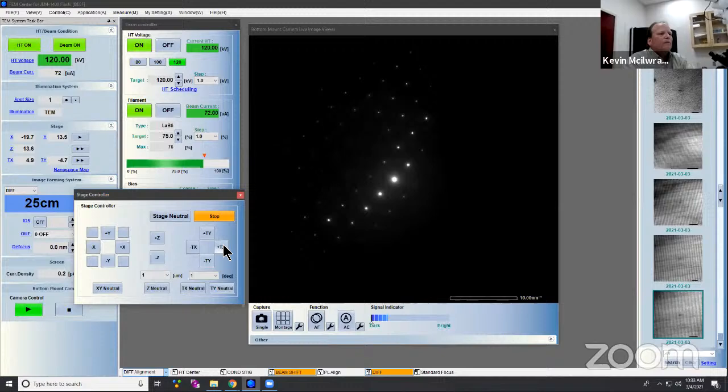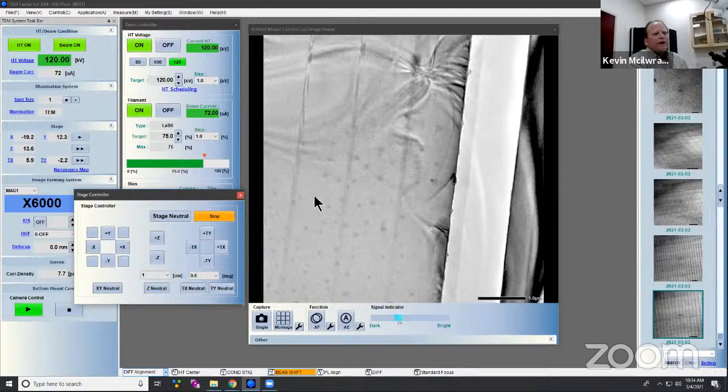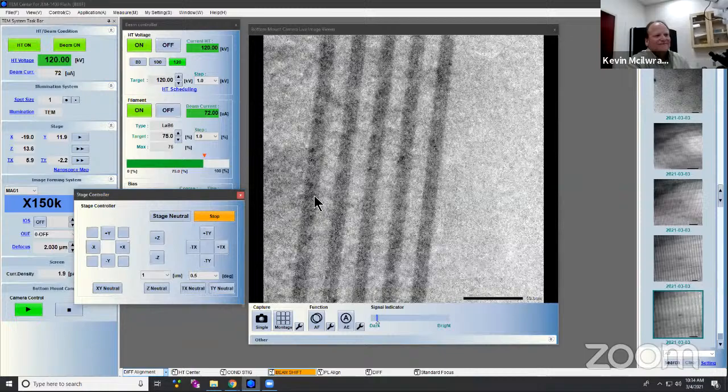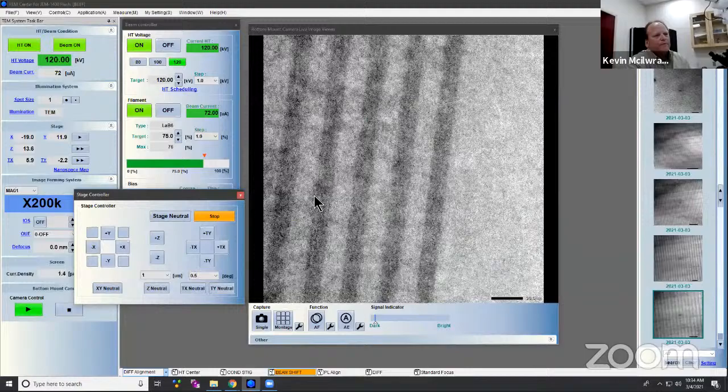Oh. Okay, a little. And I'm just orienting. Let me take a look at where I'm at. Okay, I'm still in this one area. But if you look, these thinner areas, and this is an old sample, these thinner areas actually happen to be pretty heavily amorphous. There we go. So pretty beaten up. And this sample has been sitting in my computer bag for 10 years.